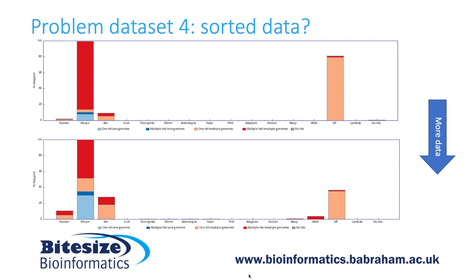Well, I think the best way to explain this is that the raw FastQ file had been sorted in some way prior to uploading. Obviously, this doesn't mean that the FastQ file is invalid, but it just would cause us to raise a few eyebrows and make us wonder whether the data had indeed been manipulated before it had been submitted to a public archive.